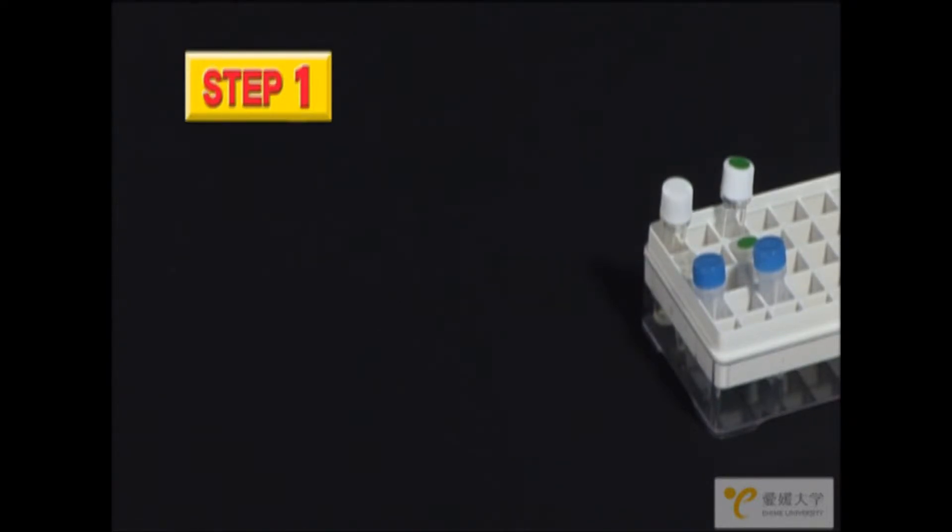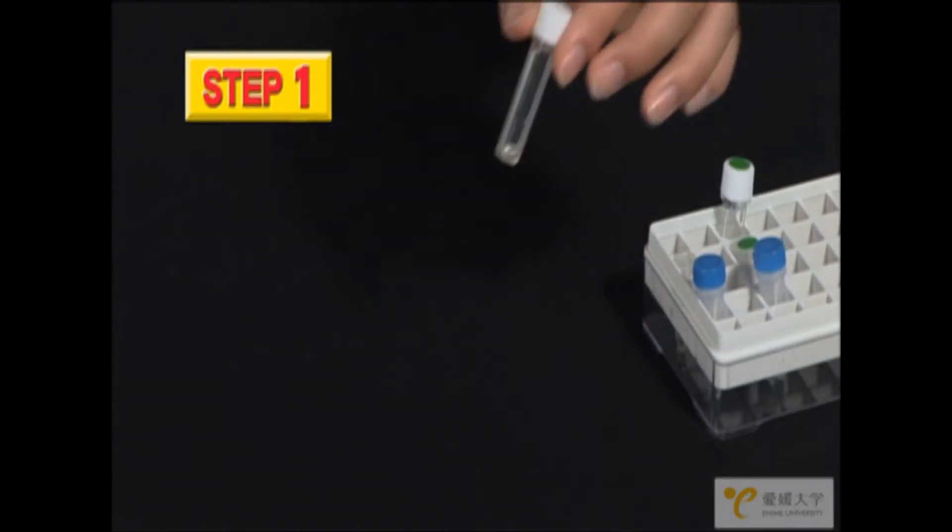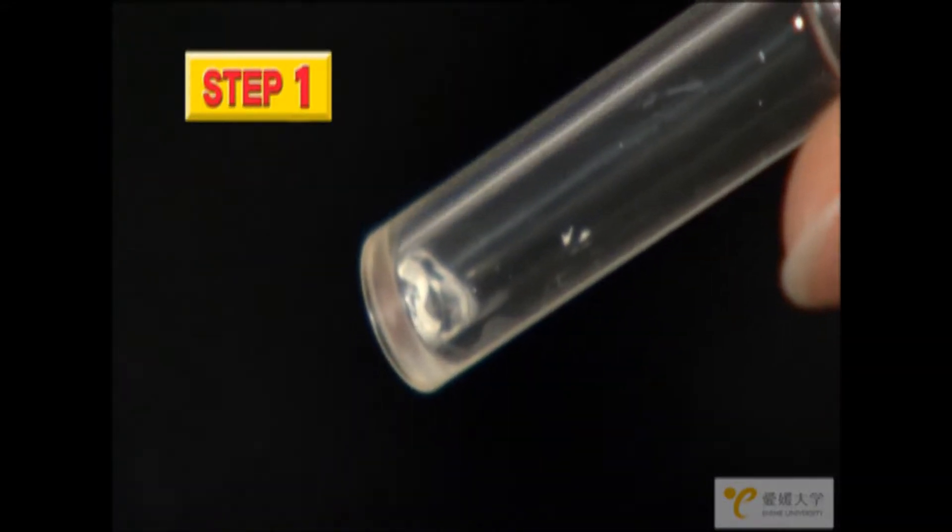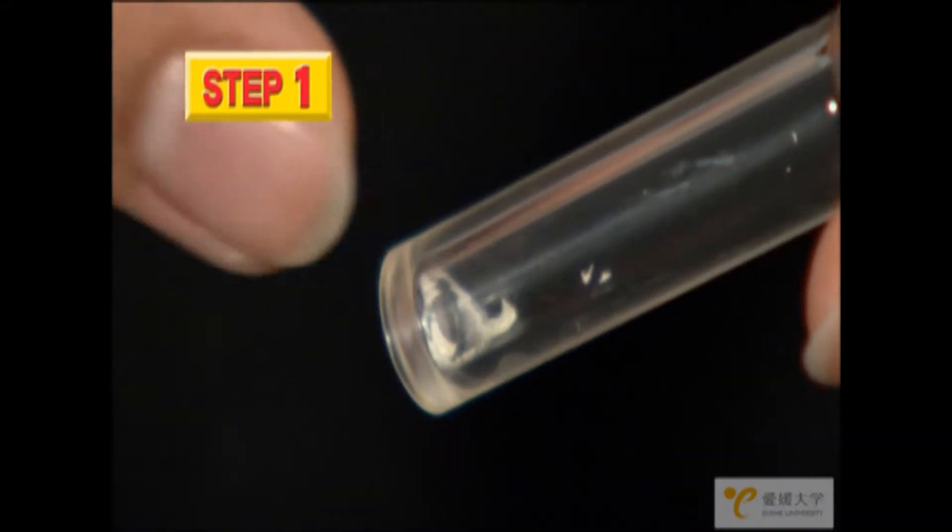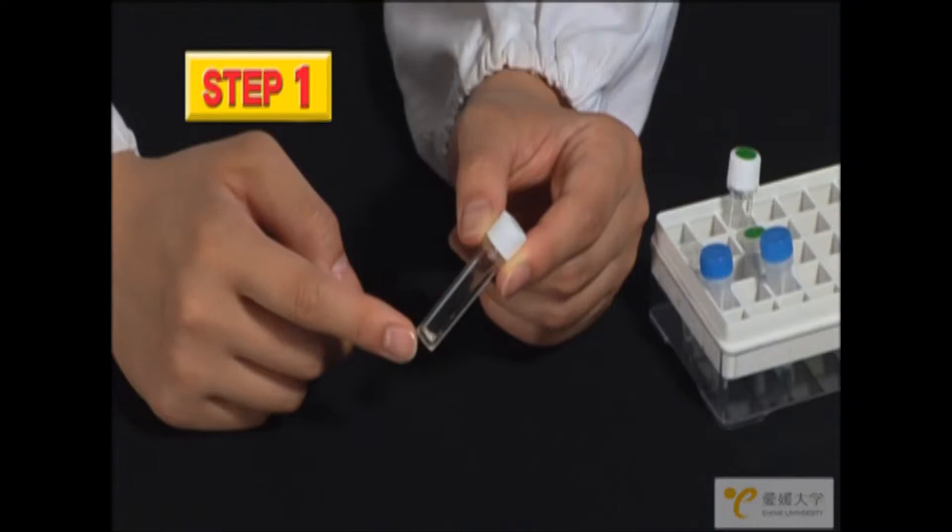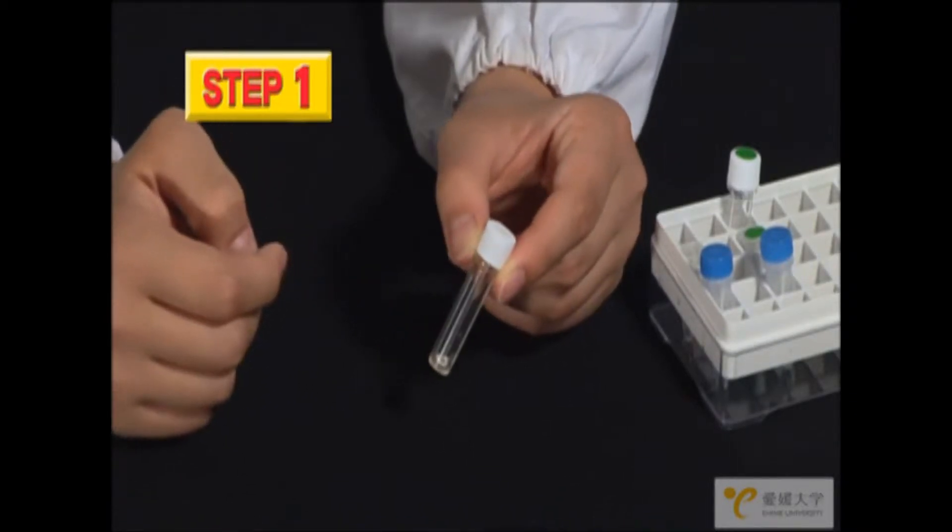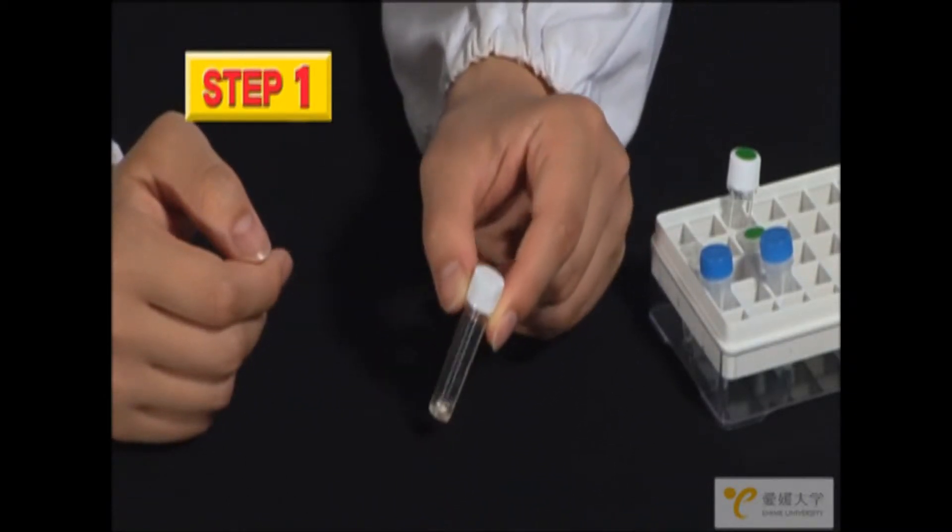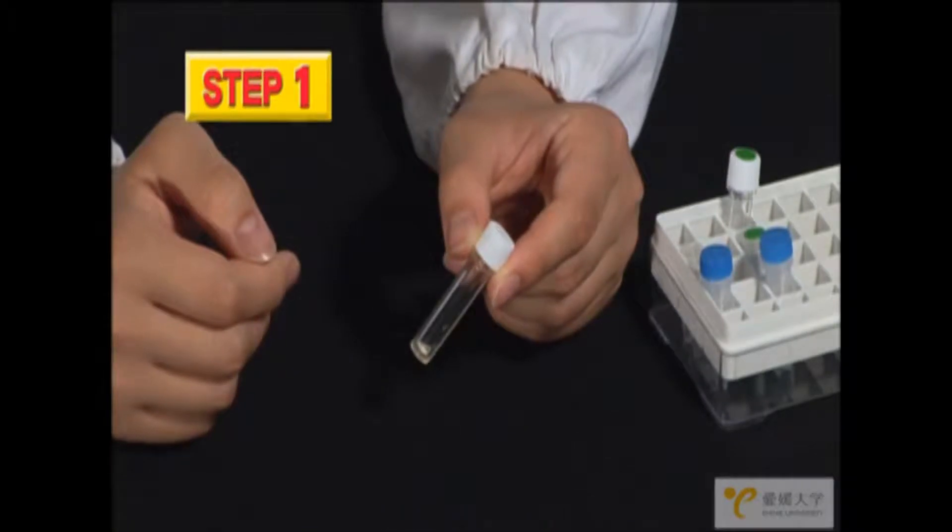Now we are ready to begin. Take the large tube without the green dot. Tap it so that the powder collects at the bottom. Then remove the cap.